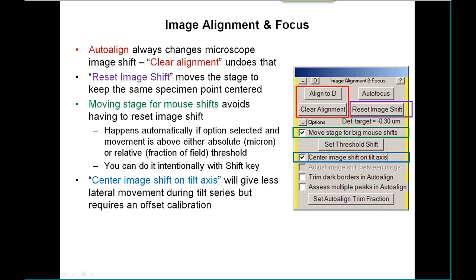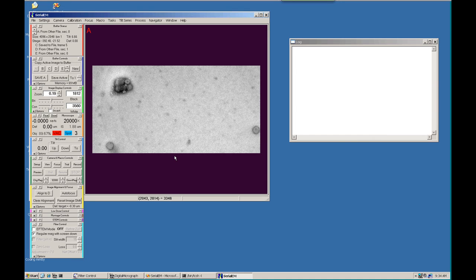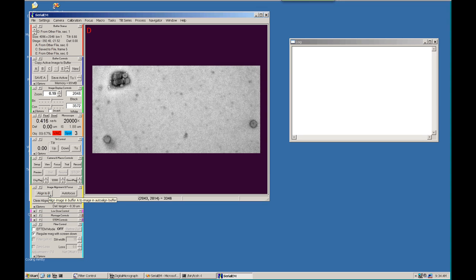Another panel coming down is the Image Alignment and Focus panel. Going back to the program, there's an example of an image in Buffer A. Imagine this one was just acquired, and with the number of buffers chosen to scroll, the alignment buffer is Buffer D. You can get there with the Insert hotkey, and you can see there's a shift between these images.